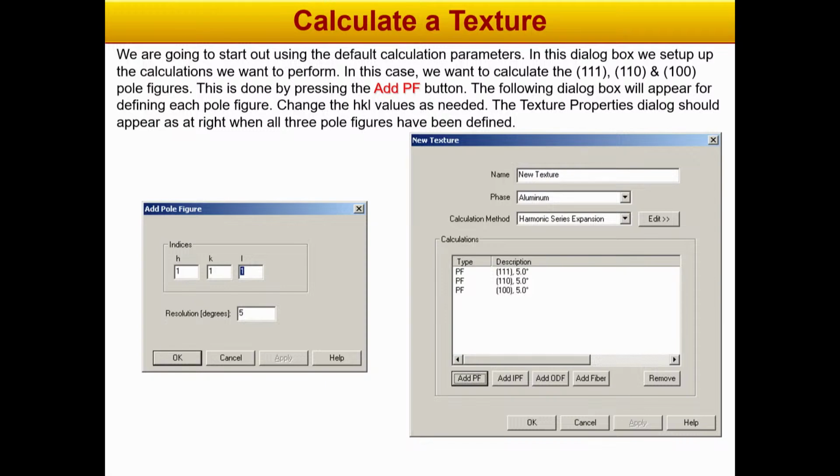What I've decided to do today is first ask if you have specific questions or specific things you're interested in doing. I remember a couple of questions from the last couple of weeks that I haven't answered, which I can get to. But tell me if there's anything with OIM analysis, as far as texture calculations or mapping or using the partition functions to select certain types of data, that you're interested in looking at today for the next 2 hours.